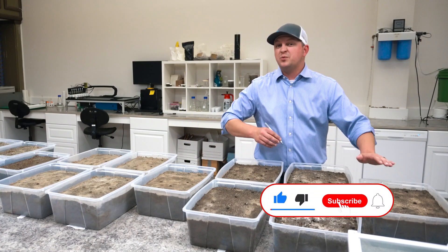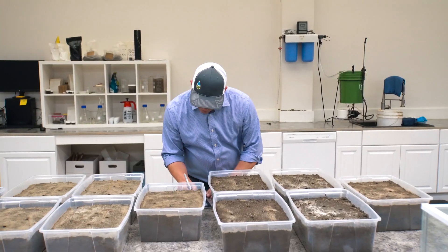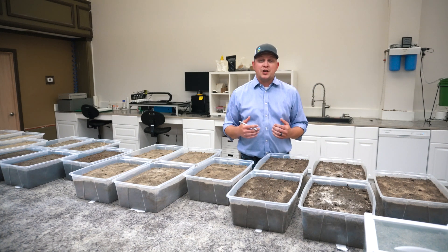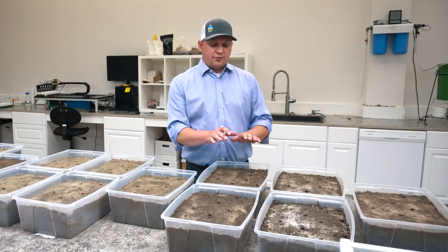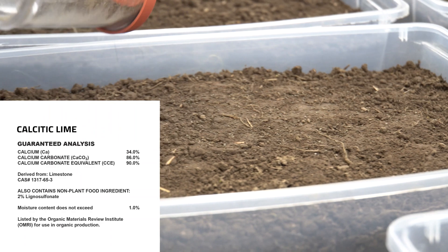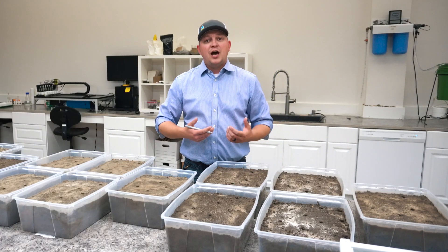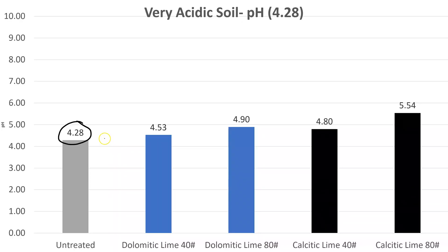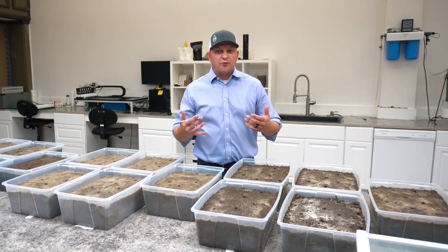This tray over here on its own was an untreated control, so that's our baseline — the starting pH was 4.28. That's very, very acidic, below the optimal range, so we want to bring that soil pH up. We treated it with 40 and 80 pounds per thousand square feet of calcitic lime, and 40 and 80 pounds per thousand square feet of dolomitic lime — you'd use dolomitic lime if you needed magnesium as well. At 40 pounds per thousand of dolomitic lime we saw the pH increase significantly, up to about 4.53.